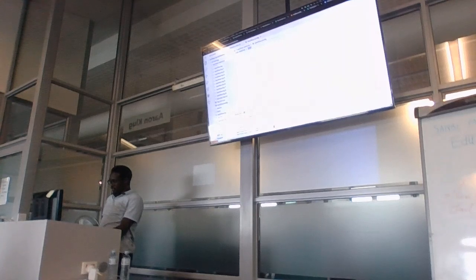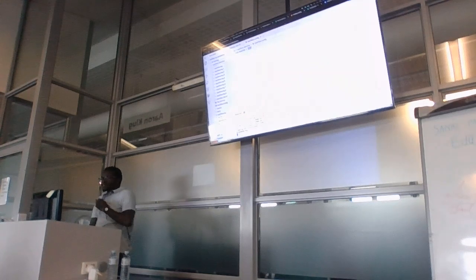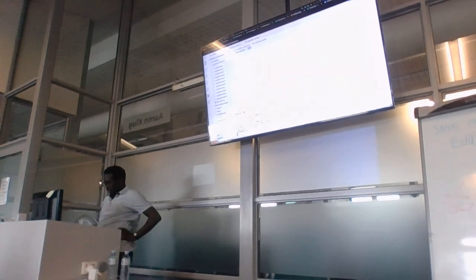And if I do this, it's going to create a conda environment within the work directory, and attempt to run the script.